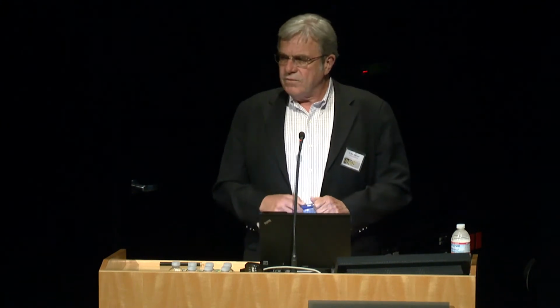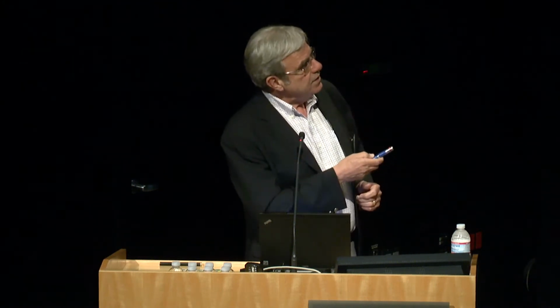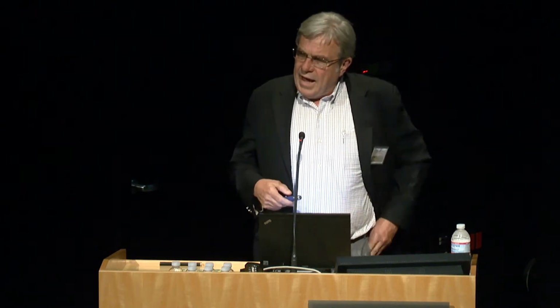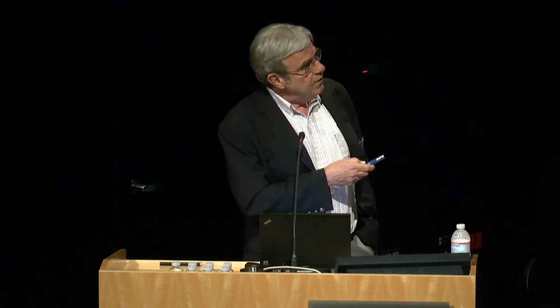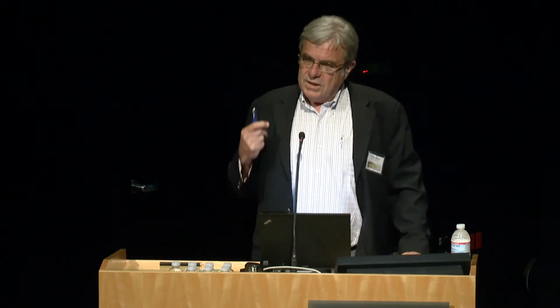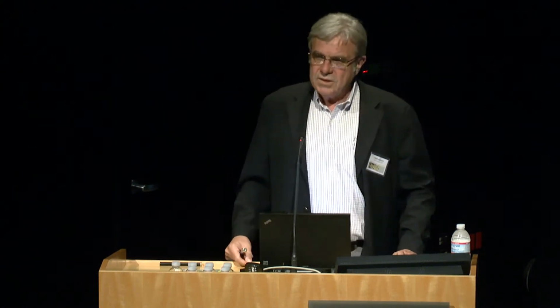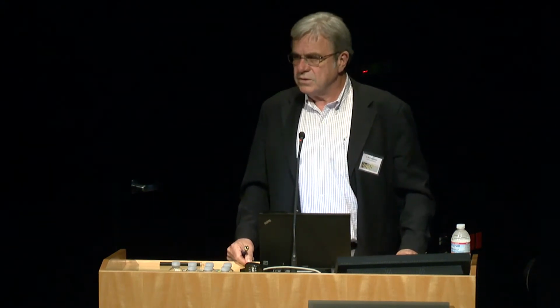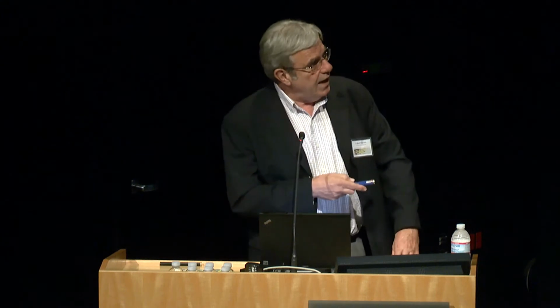The guy that I did my postdoc with, Ralph Adams, was clever enough to realize that many neurotransmitters, for example dopamine here, which I'll be using in a lot of my examples, is not only a neurotransmitter, but it's a molecule that can be oxidized very, very easily to form this orthoquinone. And when you do this oxidation at an electrode surface, you end up with electrons. These electrons can be measured as a flow of current, and the amount of current is proportional to the concentration. So that's the approach that we've used here to look at neurotransmitters.